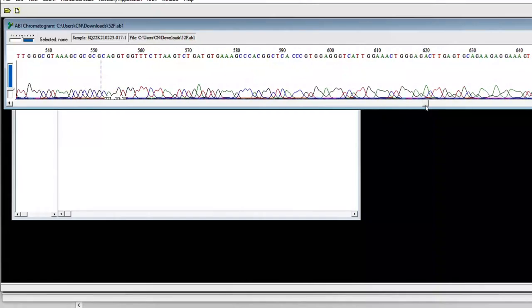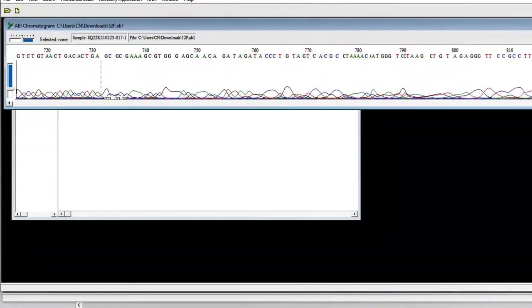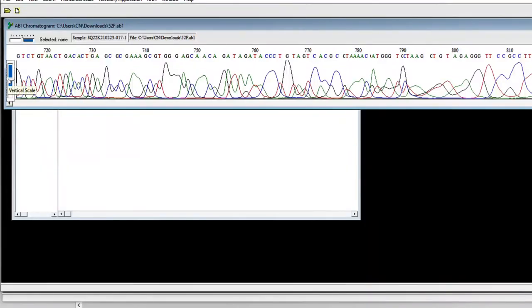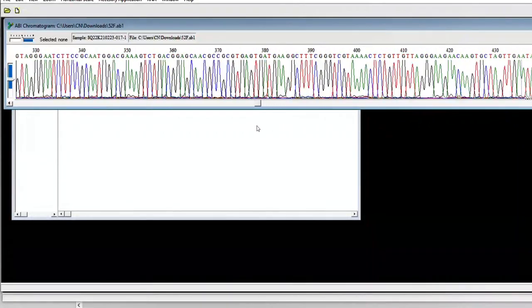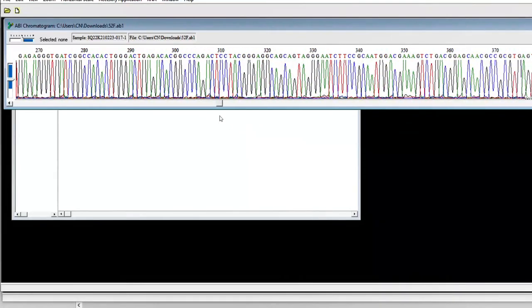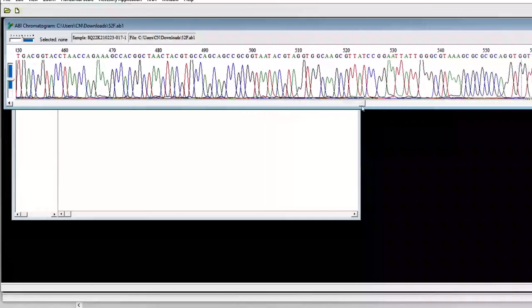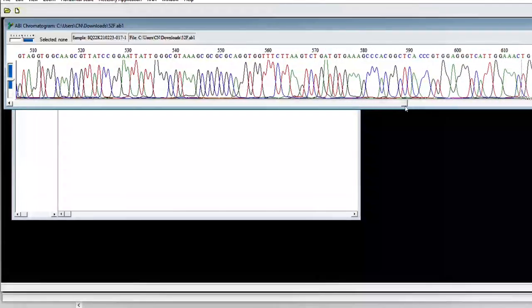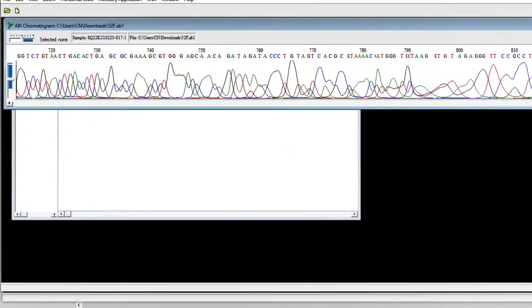When you move on, as you tend to position 600, the peaks are not as good, and as you tend to the end, they become more poor. If you increase the strength like this, you can see the differences in peaks — how much better they are in the middle region. But as you tend to the end, they become more crowded and not very good, as we have seen before.